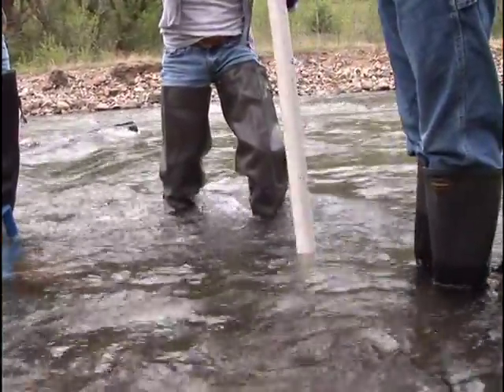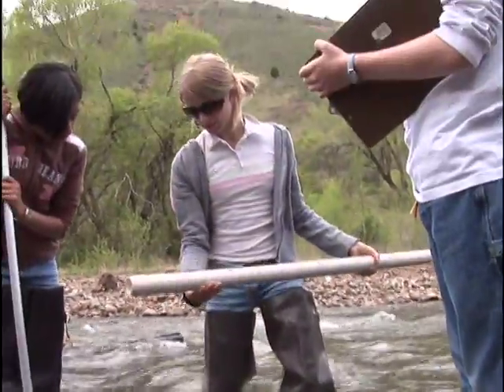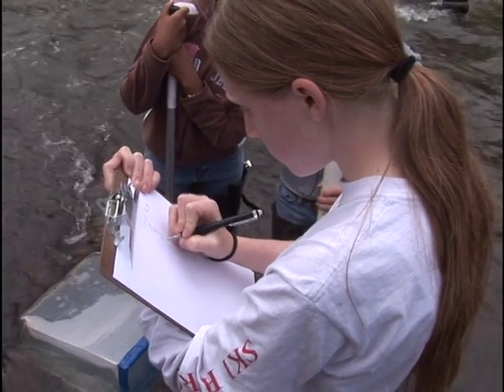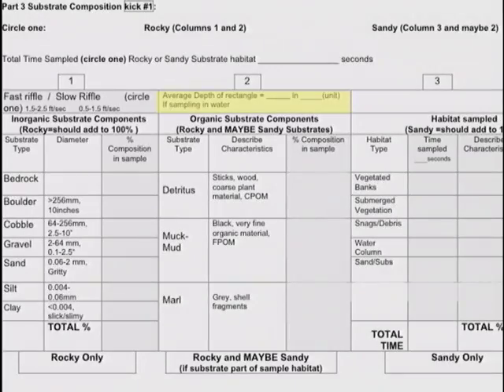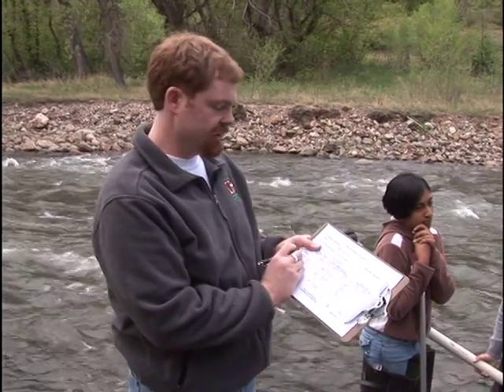Now use your measuring stick to measure depth at 4 locations within your kick area. Average these recordings to get average depth. Once we have the average depth recorded here in column 2, our depth, again, make sure to record what units you're recording in. In here, we're using feet and inches.